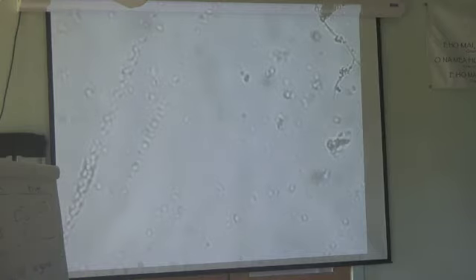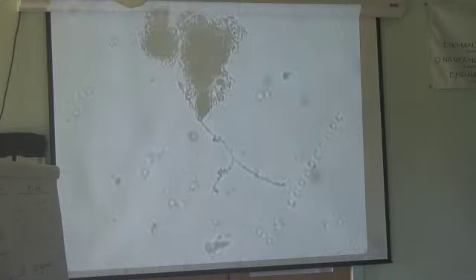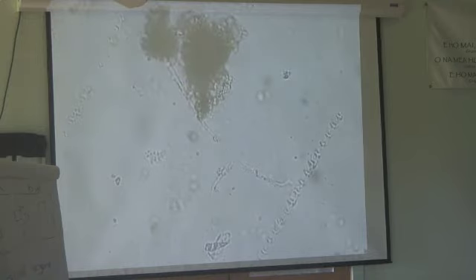So we got a spore, just bacteria, actinomycetes. An amoeba oozes. An amoeba is actually going to be oozing along. So you've got a strand of something, but it's fungus. Right there, yep, it is a fungus, but look at how narrow its diameter is. What kind of fungus is it? The only fungi we have in the sample are disease-causing fungi.